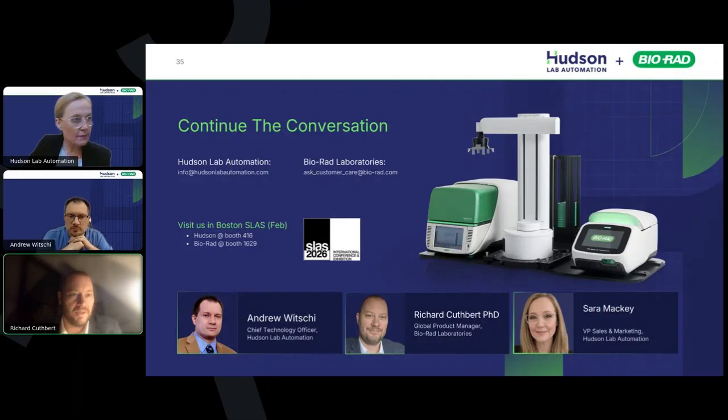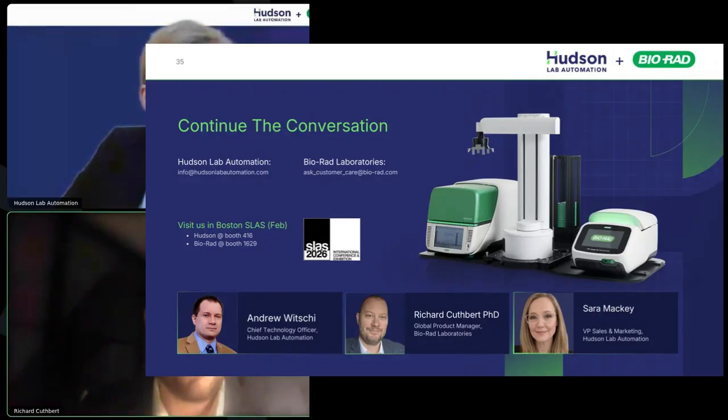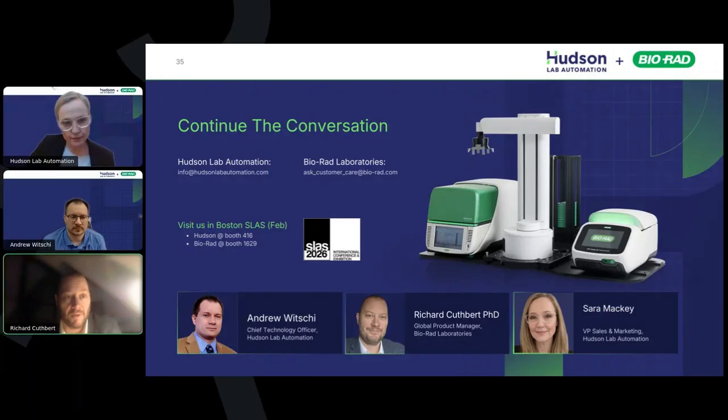But kind of any format of those two. So like round bottom, flat bottom, V bottom, and from any manufacturer as well. So you can use your favorite plate. Obviously, it's important to ensure that you have a plate that is compatible with automation as well. So it's fairly rigid, so it's gripped well. But yeah, you can pretty much use anything that you want.